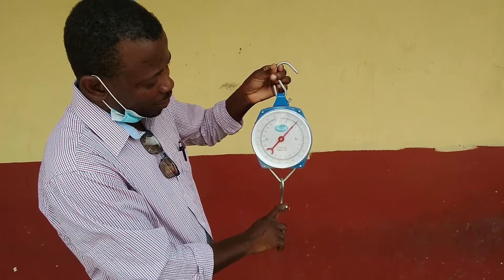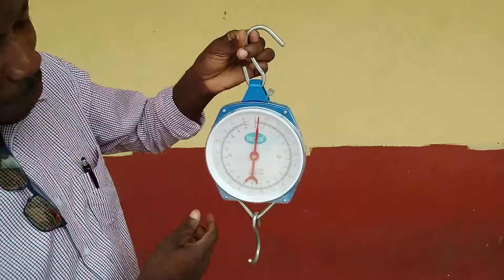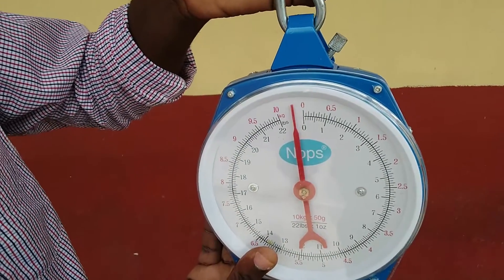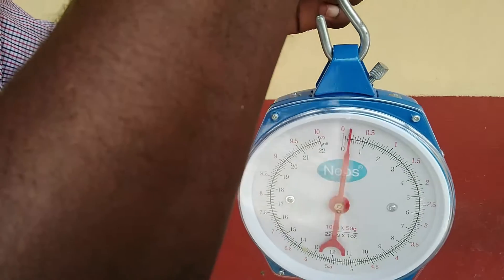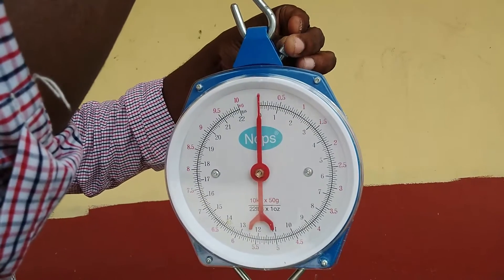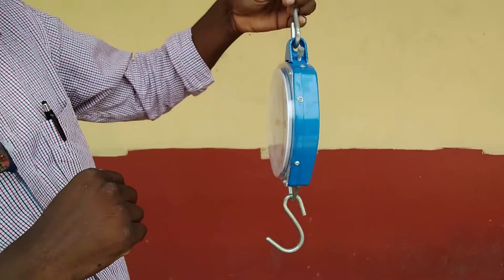That is used in the market or in the shop. Now if you look at it, you really want to ensure that before you start using this balance, it is accurate. Now it is off, so we want to ensure that it's not off — it's dead on center. So we're just going to accurately balance the scale. Is it on zero now? You don't want to read it sideways.